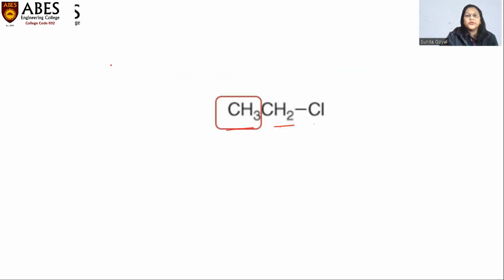In the second molecule, there are 2 sets of protons. In set 1, there are methyl groups, and in set 2, there are 2 hydrogens of methylene. They are in different chemical environments, as we see from their distance from chloride, which is an electronegative atom.